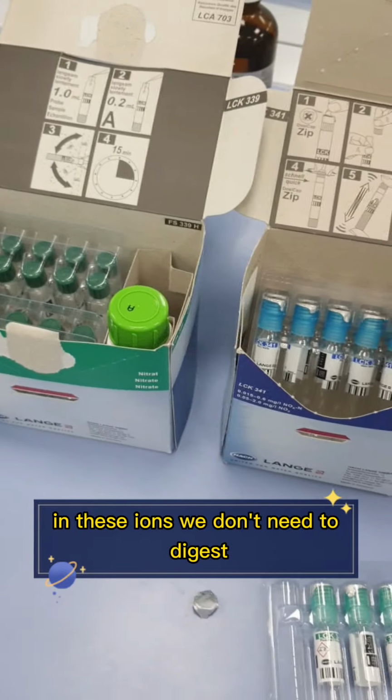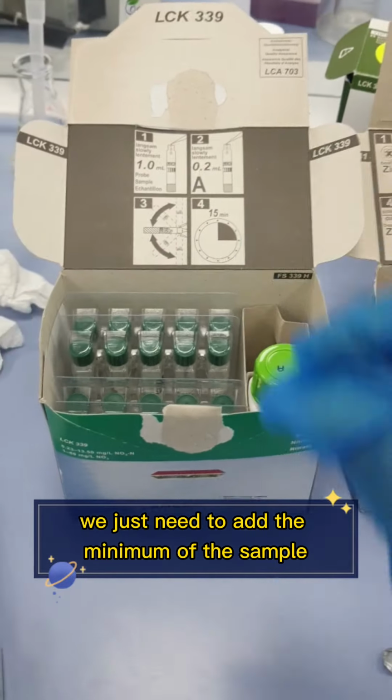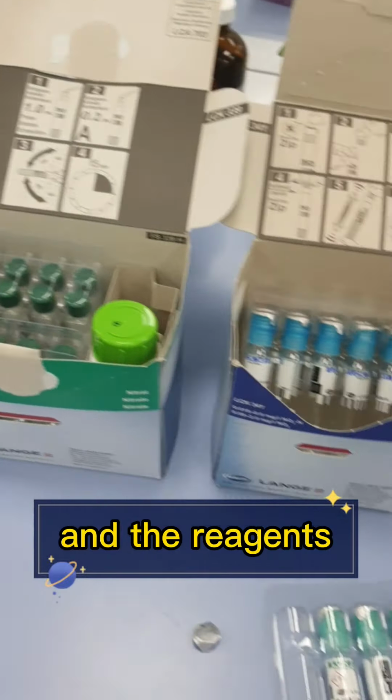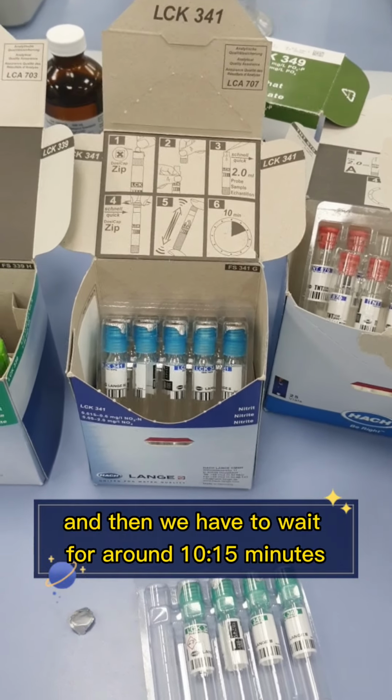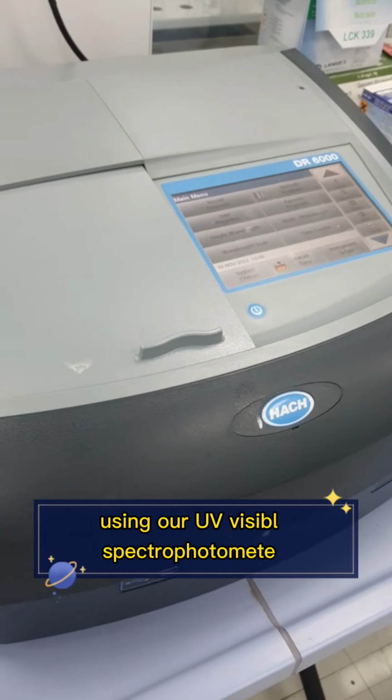In these ions, we don't need to digest. We just need to add the minimum of the sample and the reagents, and then we have to wait for around 10 to 15 minutes. Then we can measure these using our UV visible spectrophotometer.